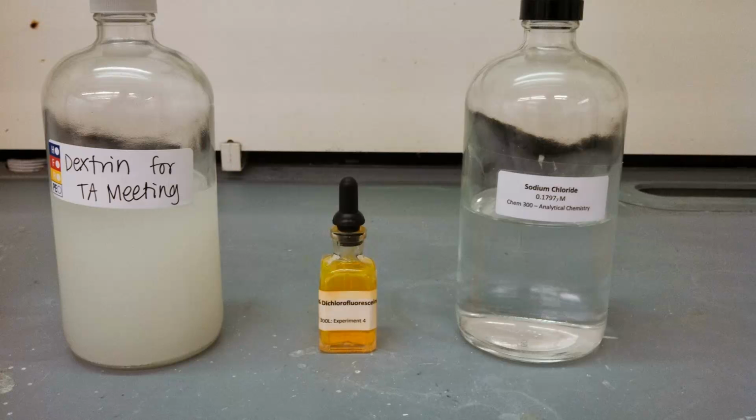The materials that you need for this, some solutions that will be in the hood and on your benches, are the dextrin and the dichlorofluorescein, which are the indicators, and a sodium chloride solution. This is your primary standard. There's going to be a concentration on the bottle. You need to make sure that you write that down. It will not be the number you see here. It'll be some different solution.